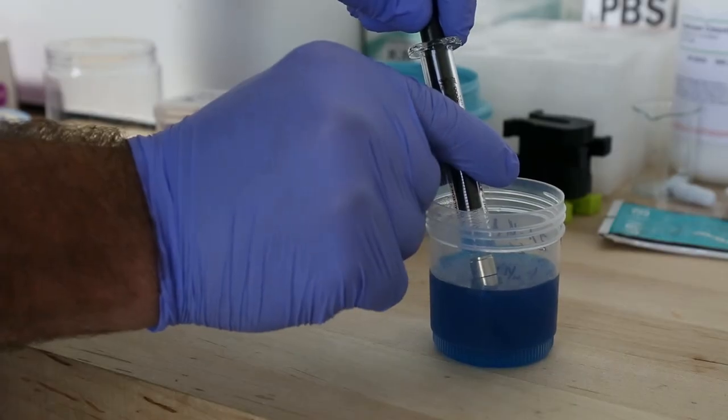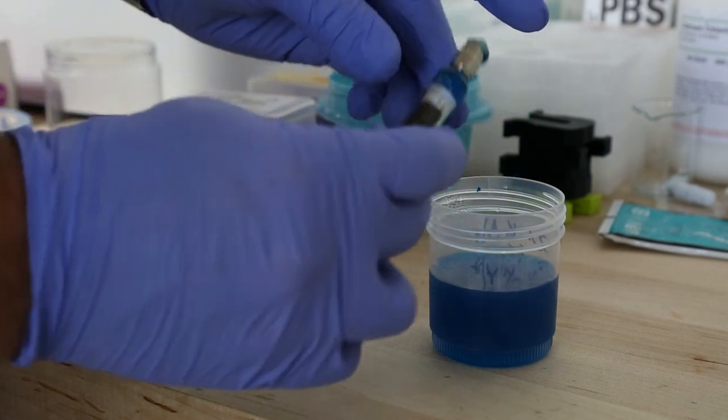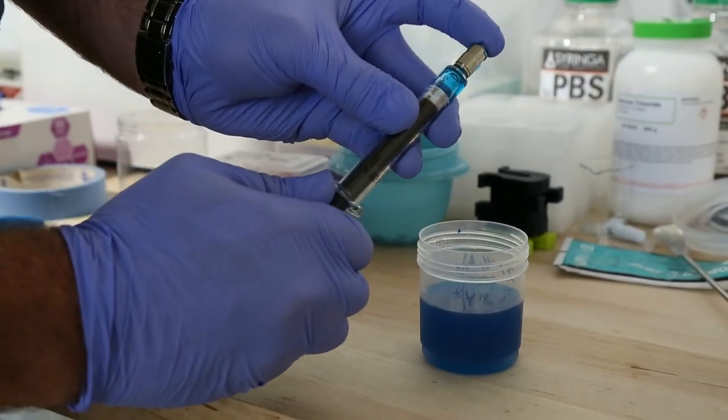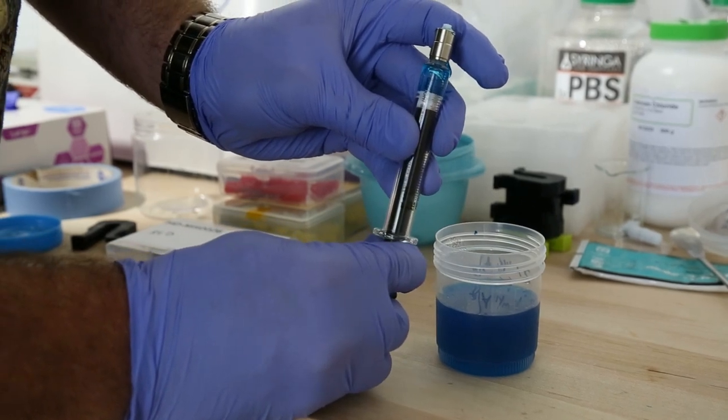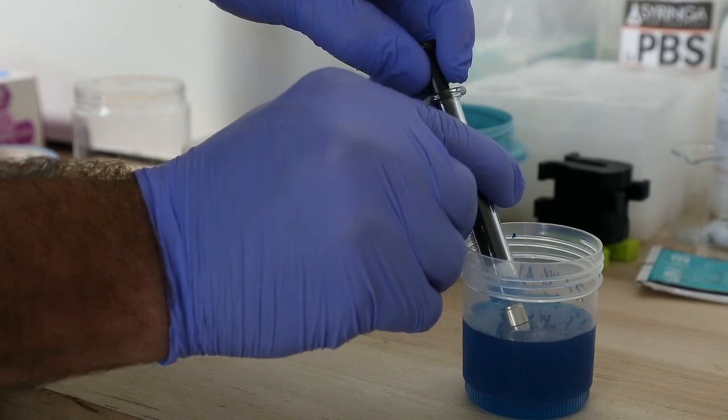So now we're gonna load our 5 milliliter gas-tight syringe. We've got a big air bubble on the top so I'm gonna stop, flip it upside down, put my finger over the top, pull vacuum, and release. And now I should be able to push the air bubble out the top and then continue filling.